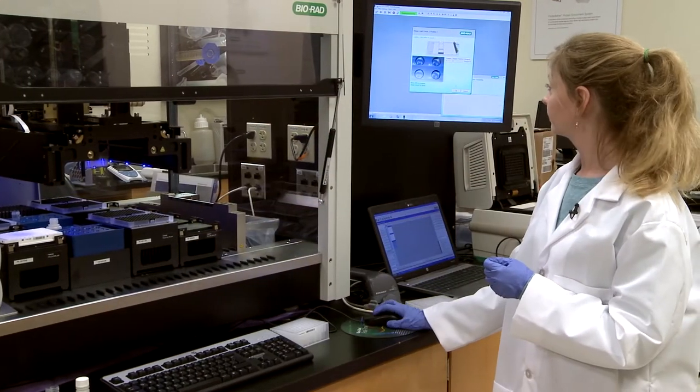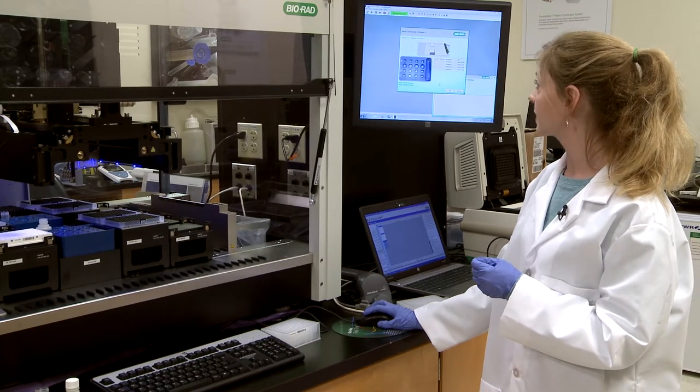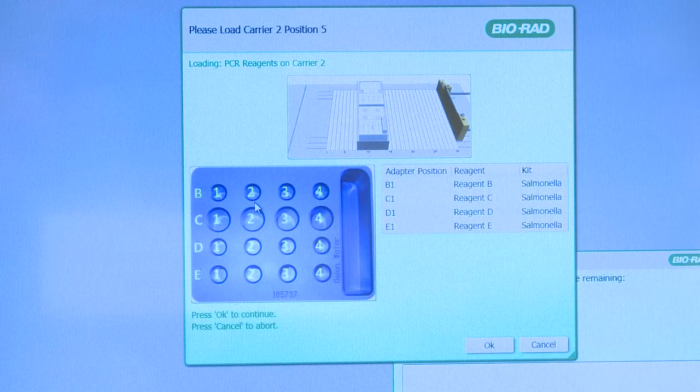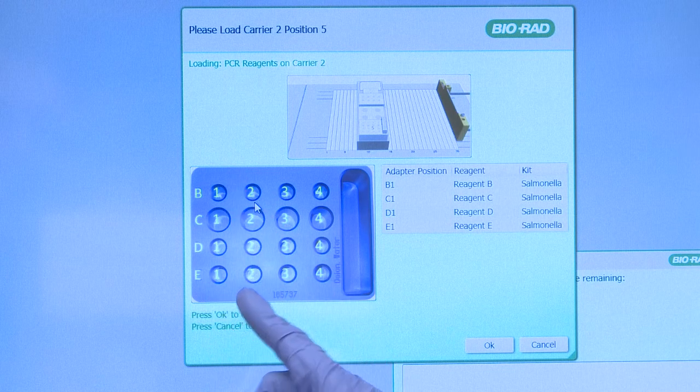Easy so far. Click OK. What's next? Now our PCR reagents get added into this block. You'll see they get added into positions B, C, D and E.